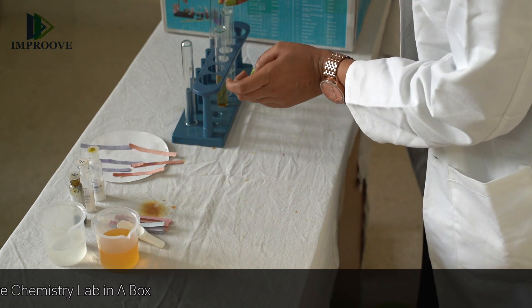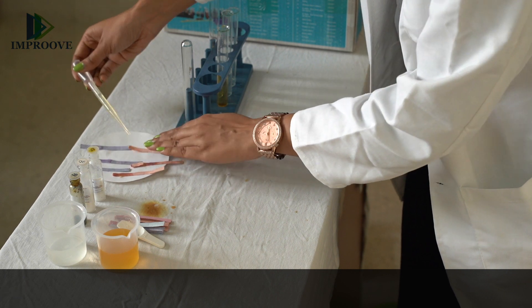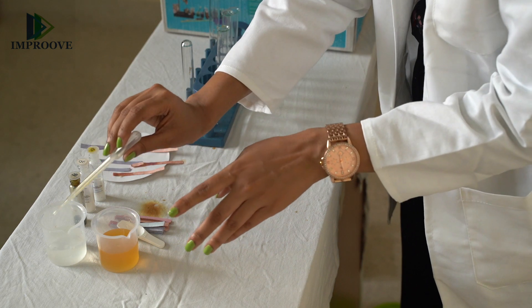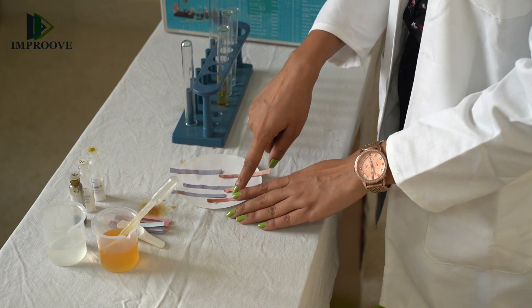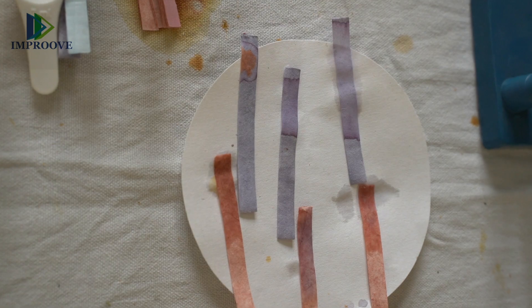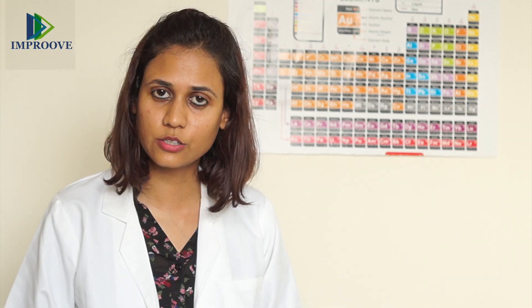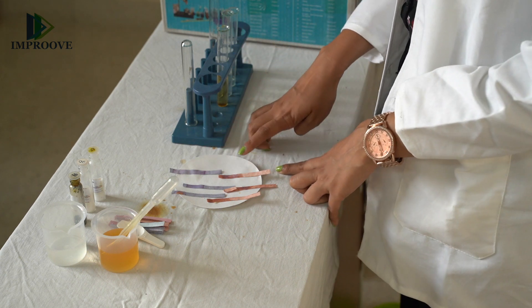You will observe that as soon as the ferric chloride solution was poured on the blue litmus paper, it changed color to red, but had no effect on red litmus paper. The sodium acetate solution had no effect on blue litmus paper but turned red litmus paper slightly blue. The sodium chloride solution showed no effect on either blue or red litmus paper.